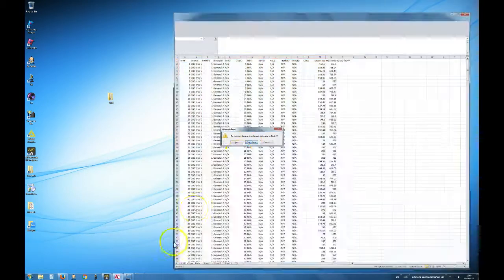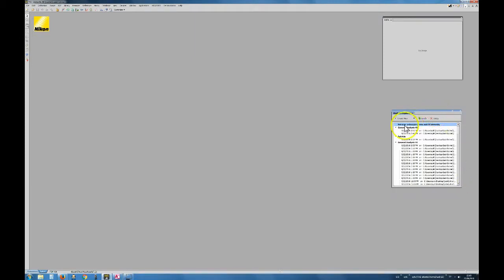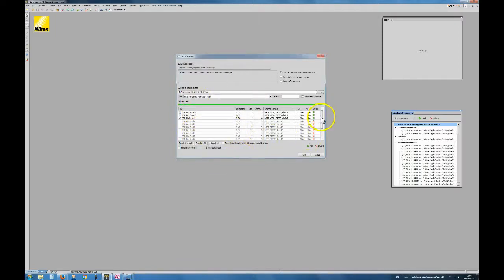Now I go back to my stuff, I close this, I have my analysis here that I have loaded, and now I get this button called batch. So what I do is open this and point to the folder, let's say in here, where I have several images. It recognizes automatically which of the images can be analyzed, because these have 4 channels, the others have only 3 channels, and here I need the 4 channels.